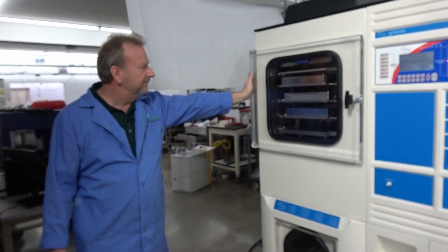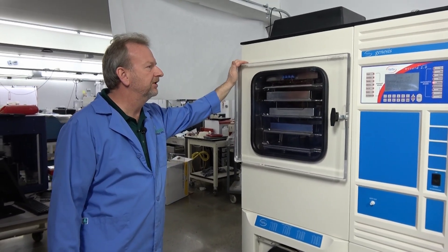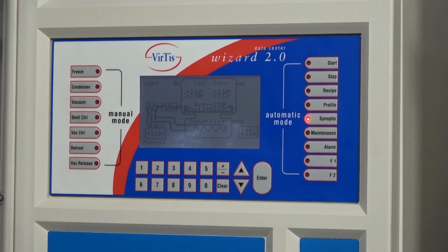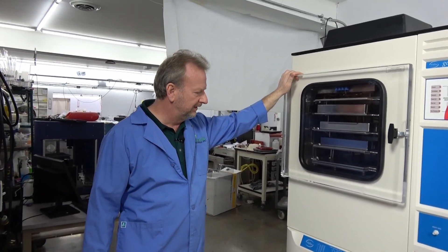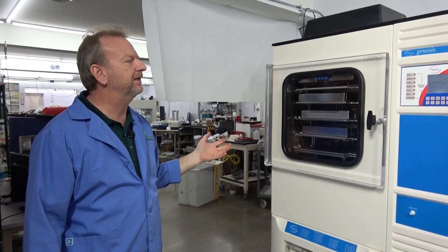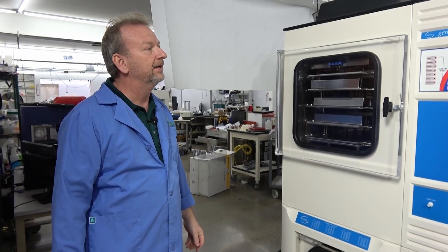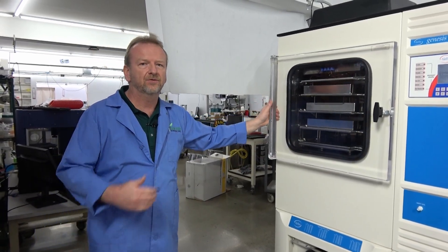This is basically the next step up from the Advantage. What's really nice is that the Wizard 2.0 control panel is the same panel used in the Advantage, the Genesis, and the Ultra. So when you have recipes saved, you can just upload them right to the next machine. If you want to step up your game, it's straightforward — save a recipe and move it over.